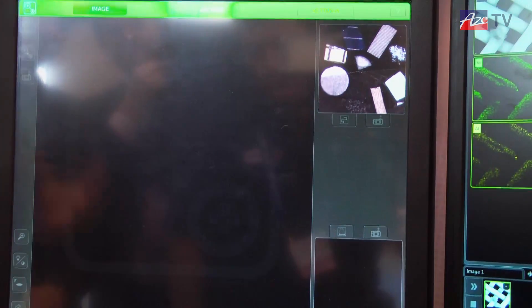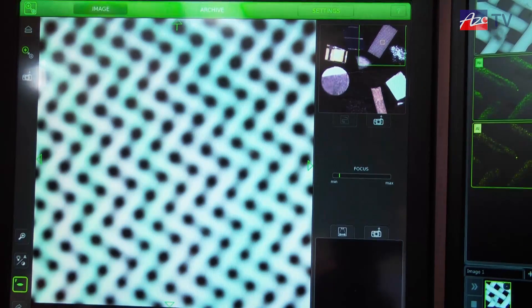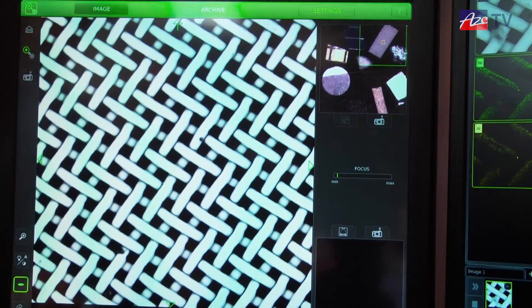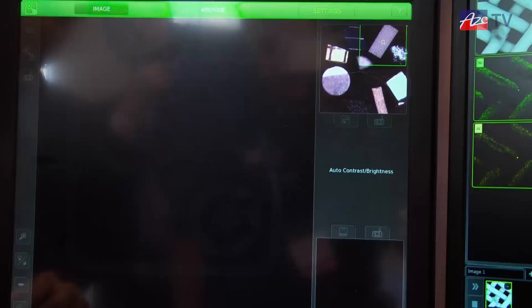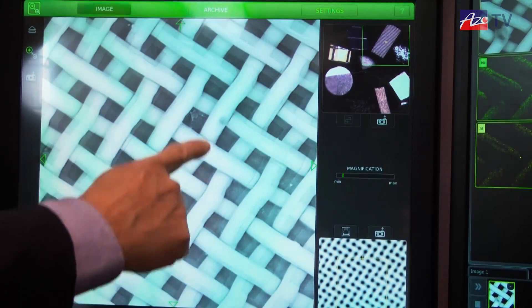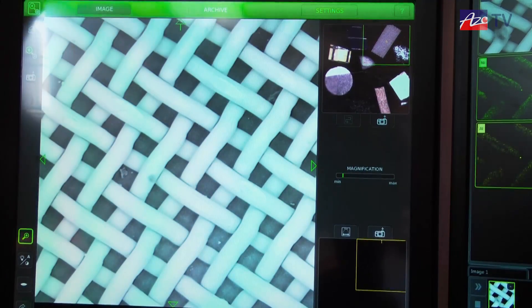First you get an overview of your sample. You can do an autofocus — the system looks at the sample and optimizes the settings. And now all we need to do is go up in magnification and start looking for the nice part of the sample, doing a little bit of focusing ourselves.